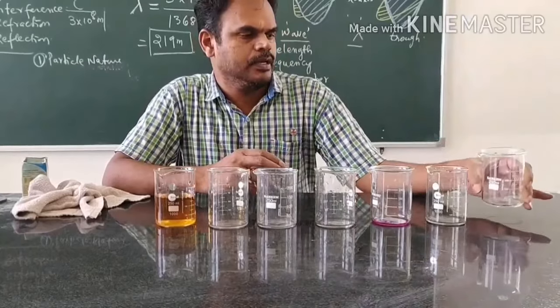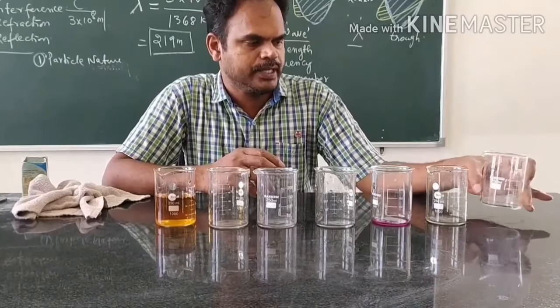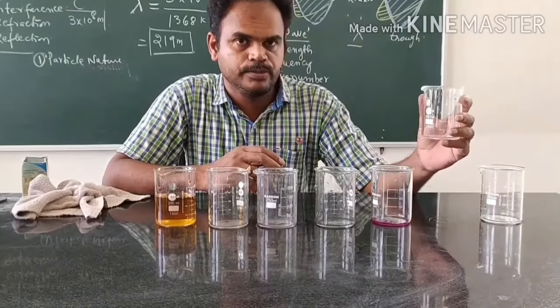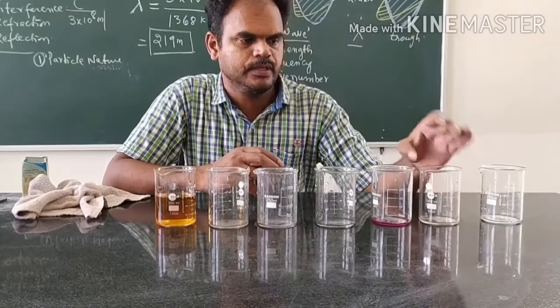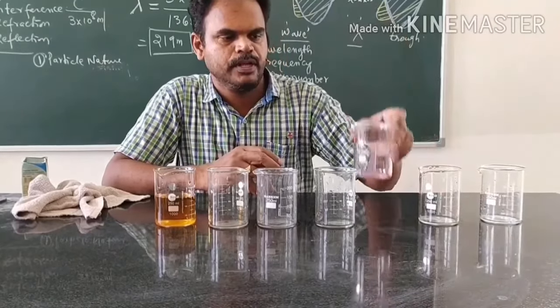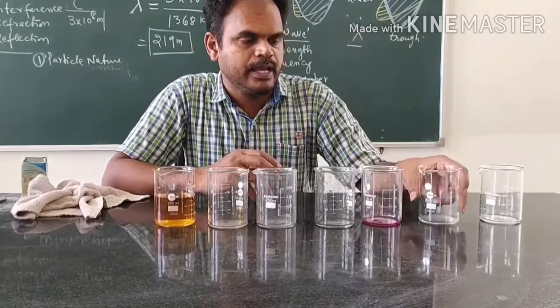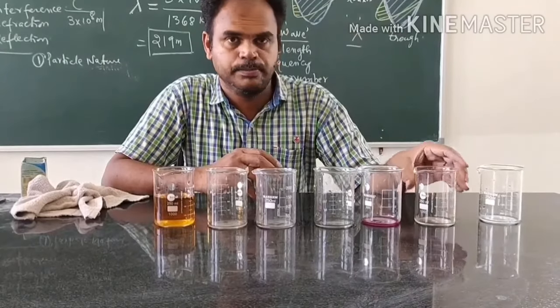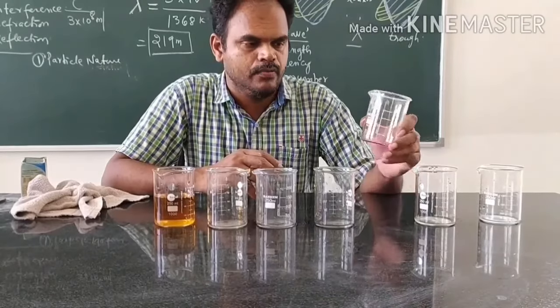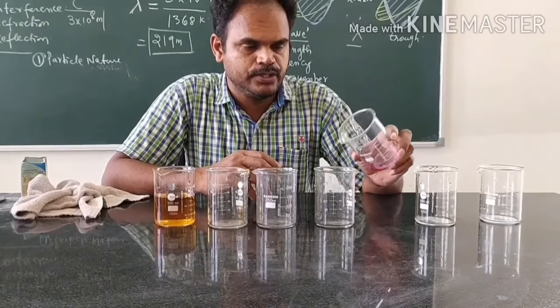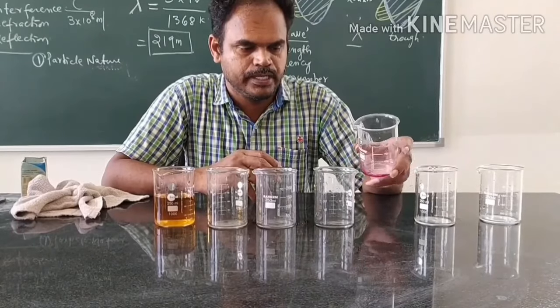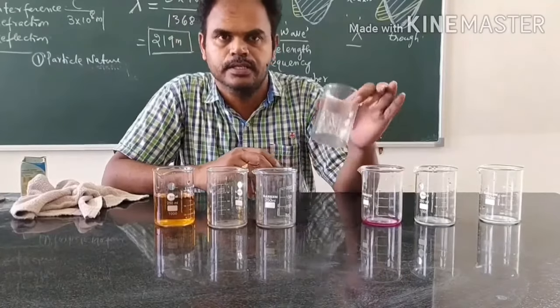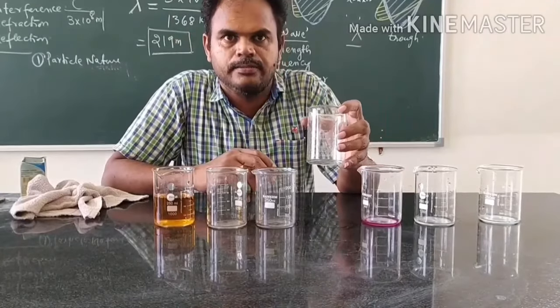I have taken water in the first beaker. In the second beaker, I have added two drops of sodium hydroxide. In the third beaker, I have taken phenolphthalein indicator. When I add the base to the phenolphthalein indicator, it turns pink. When I add this pink solution to an acid, I will get a colorless solution because phenolphthalein does not show color in acid.